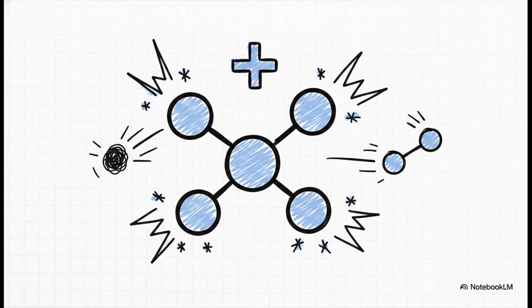So the game always begins with the initial ionization event. Picture this. In the ionization chamber, a collision with electrons strips exactly one electron away from our sample molecule, and that leaves behind a radical cation. Now that's a molecule with an odd number of electrons and a positive charge. This radical cation is our starting point. Because it just absorbed all that extra energy from the collision, it's in a highly excited vibrational state. It's vibrating so intensely that it simply has to break apart.